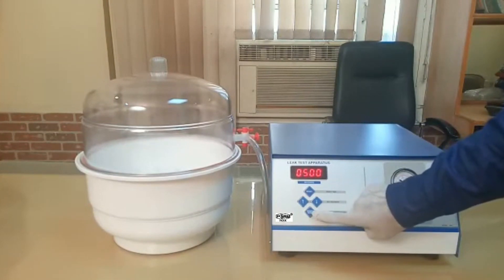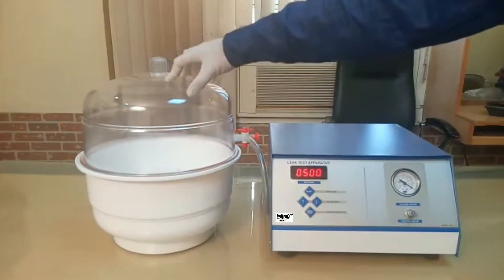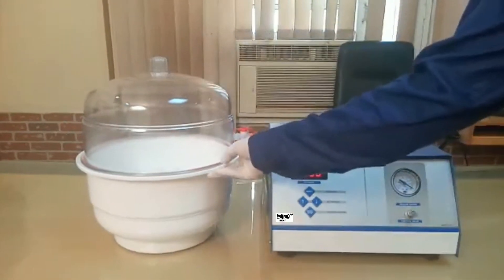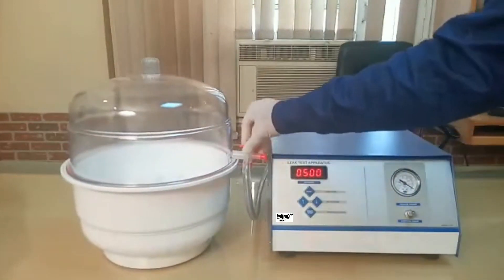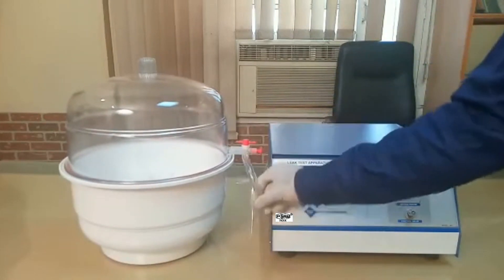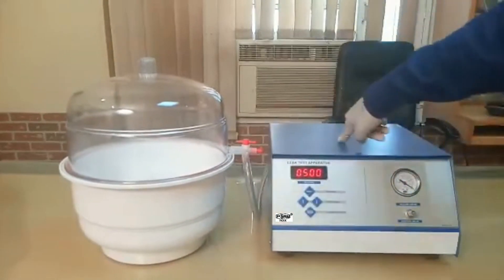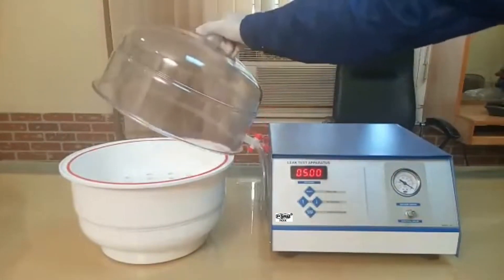In the earlier model 1961, this is the desiccator — a 12-inch desiccator — with a top cock and a notch connected to the desiccator. The pipe is connected at the back side of the instrument. The desiccator will be the same for both cases.